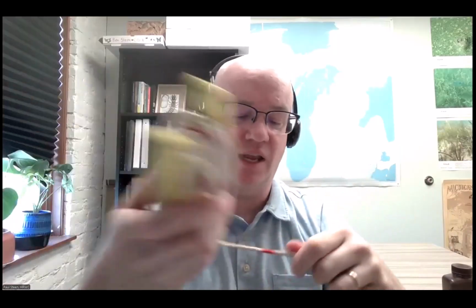Now, one thing that you will have to provide is a rope to attach to this sampler. So just even a clothesline will do. And you mark this rope every foot. You don't have to put a number on the rope, but you do need to mark it every foot so that when you start using this, you can count off the number of feet that you're letting out.